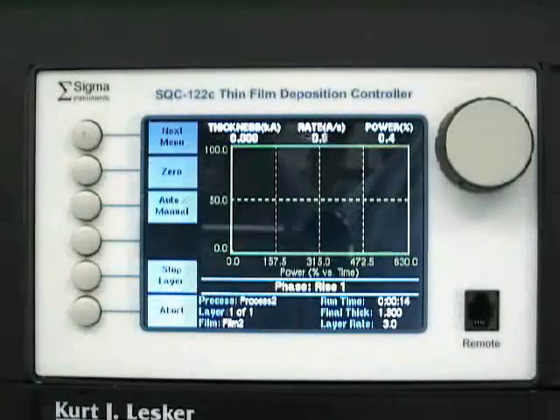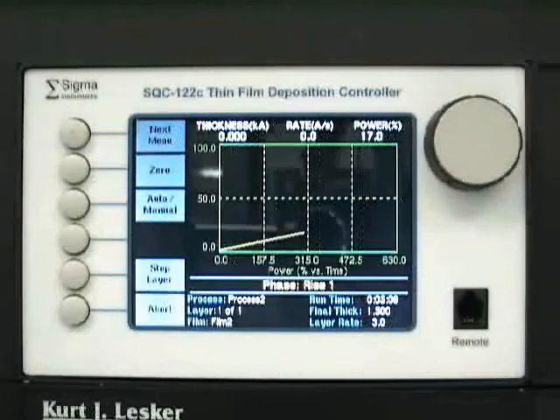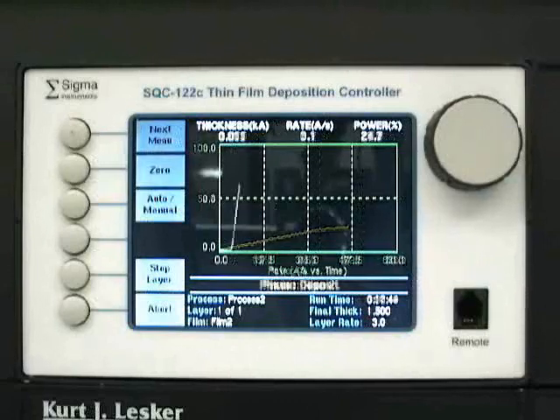You should monitor the entire deposition process to ensure proper execution. If any problems should arise during the deposition process, you should contact an MIRC staff member. The deposition process on the PVD system is fully automated and will end once the desired thickness is reached.